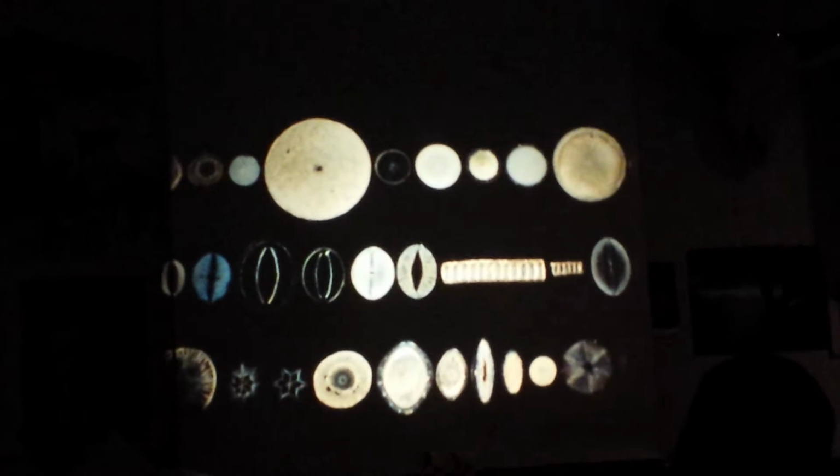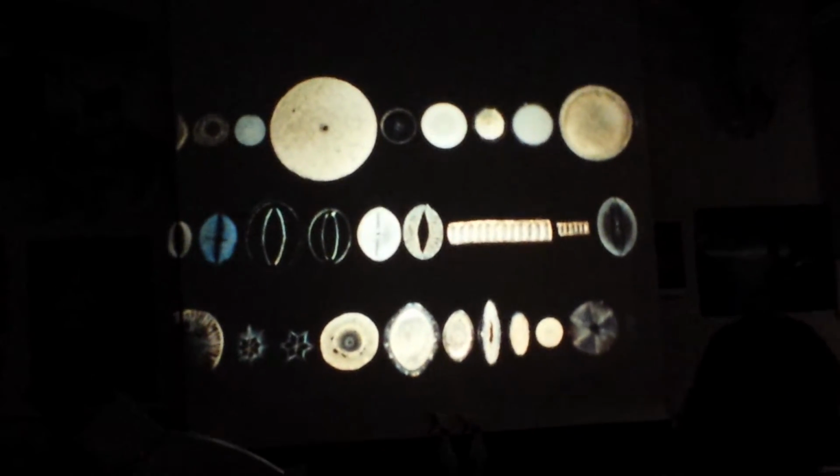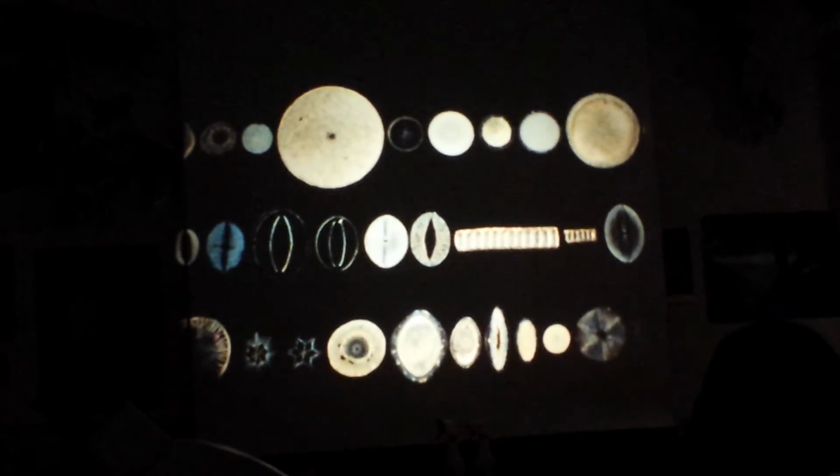This is just diatoms. This is what people that study diatoms do in their spare time. Line them up under a microscope and take pictures of them.